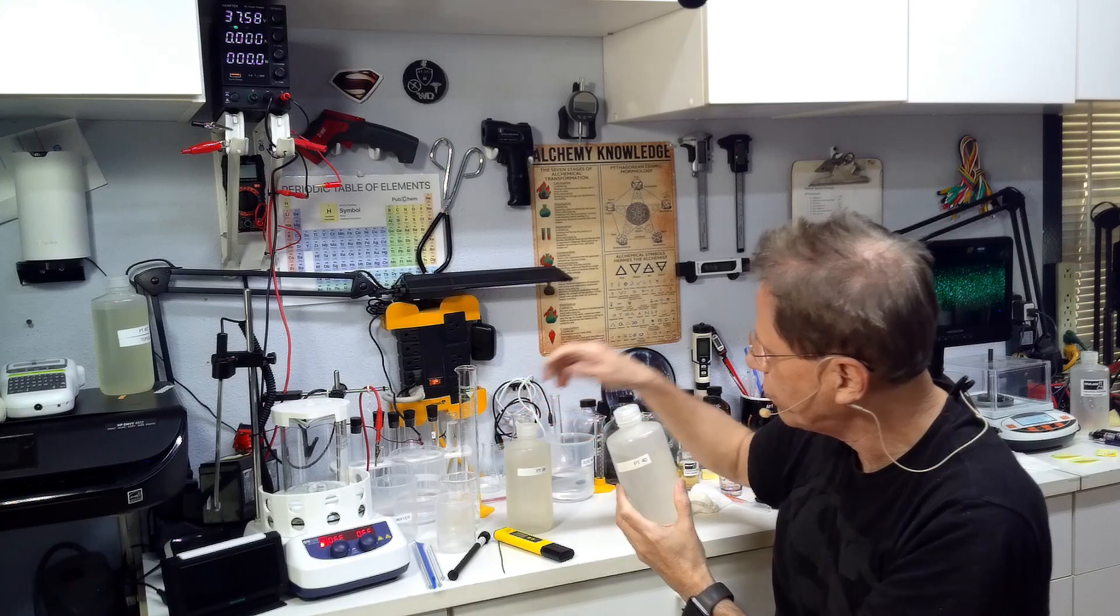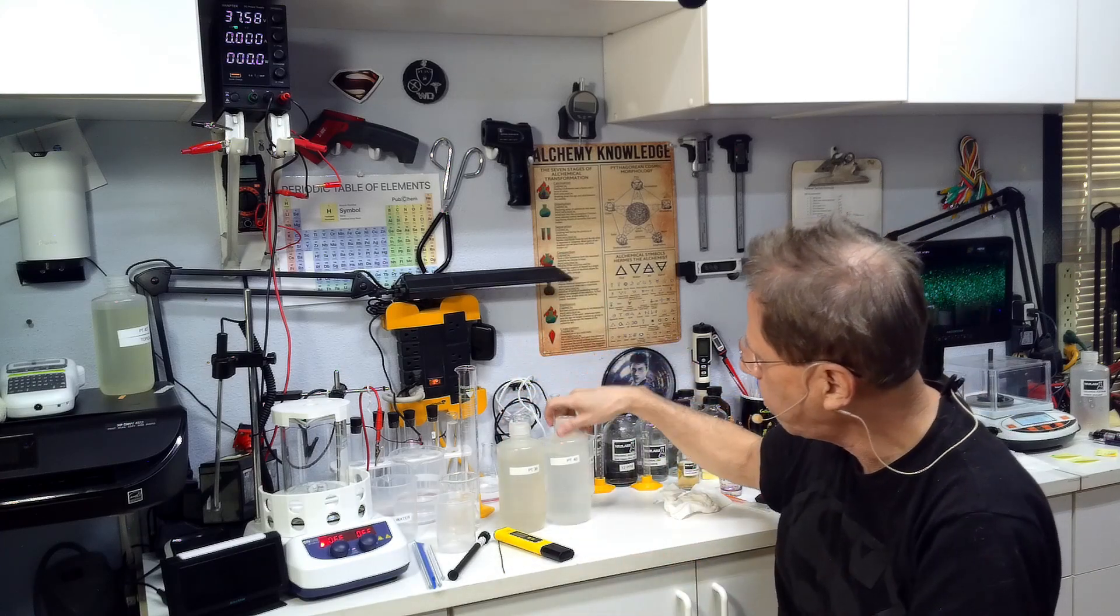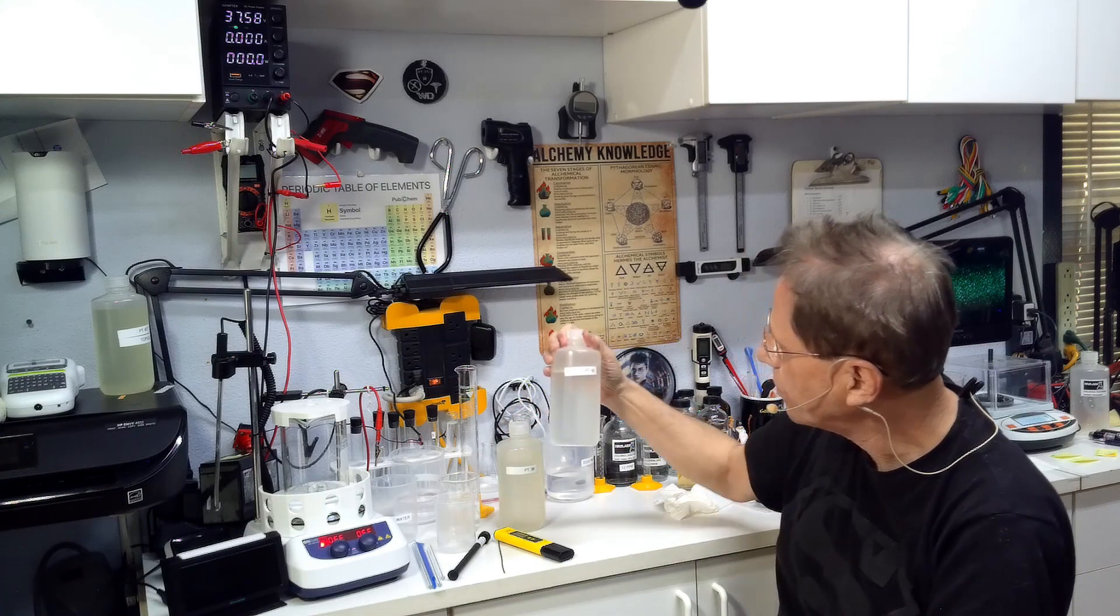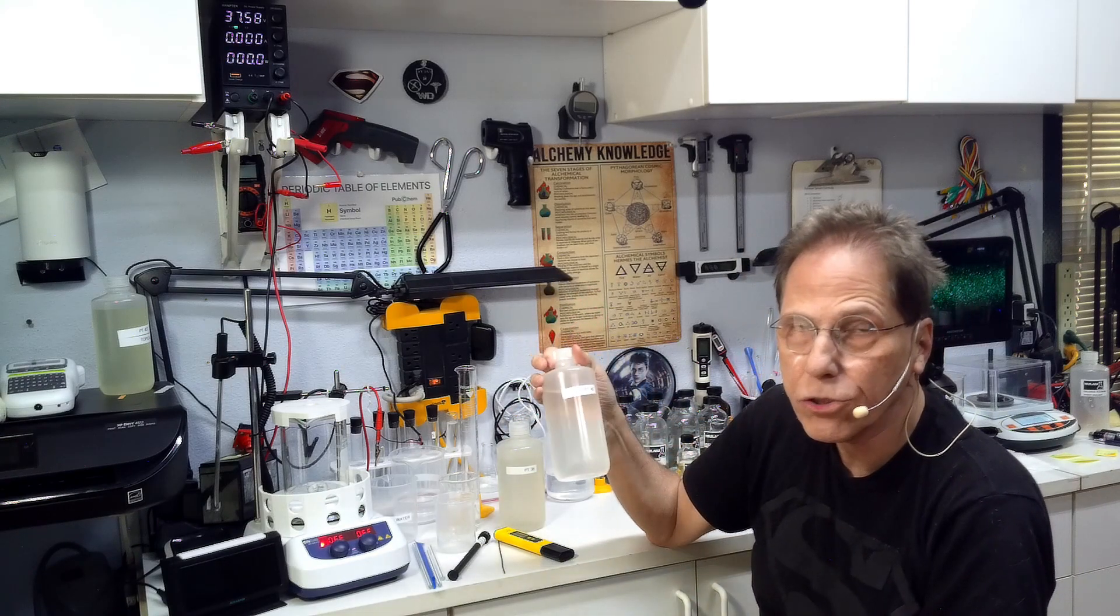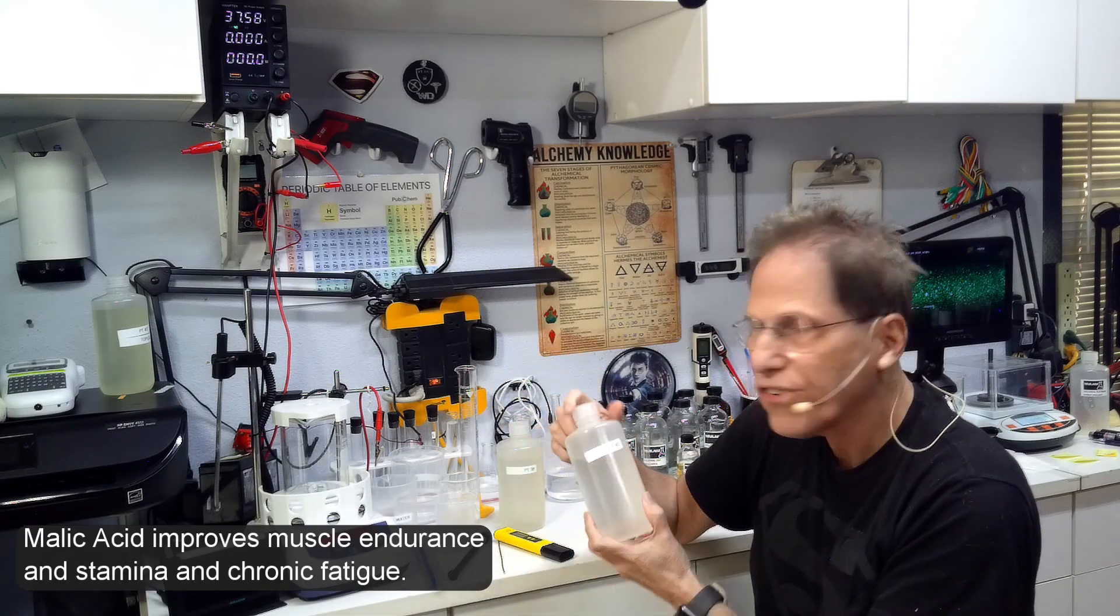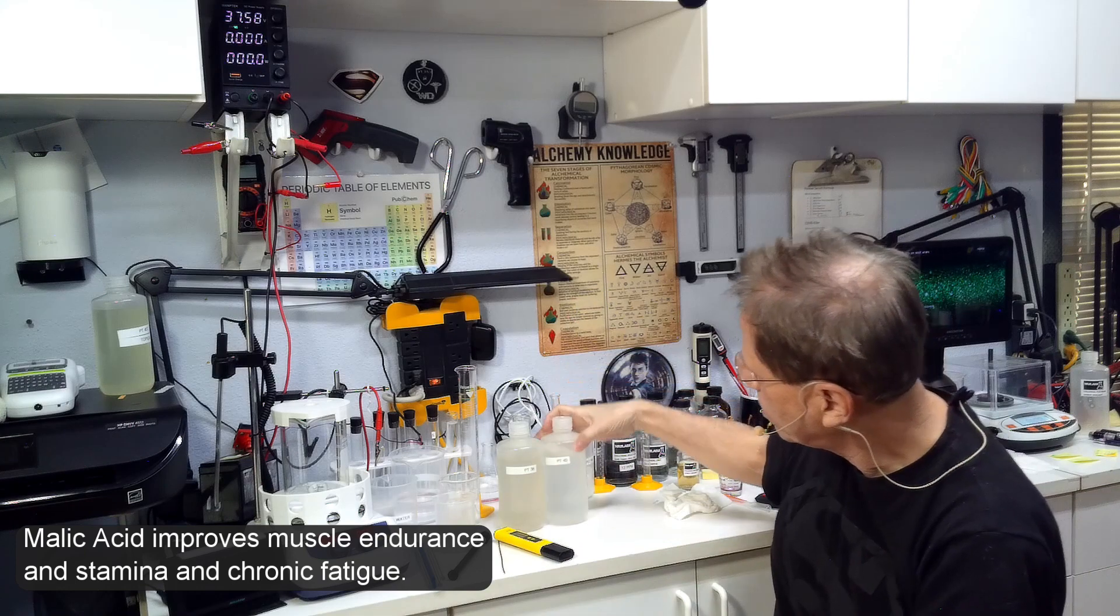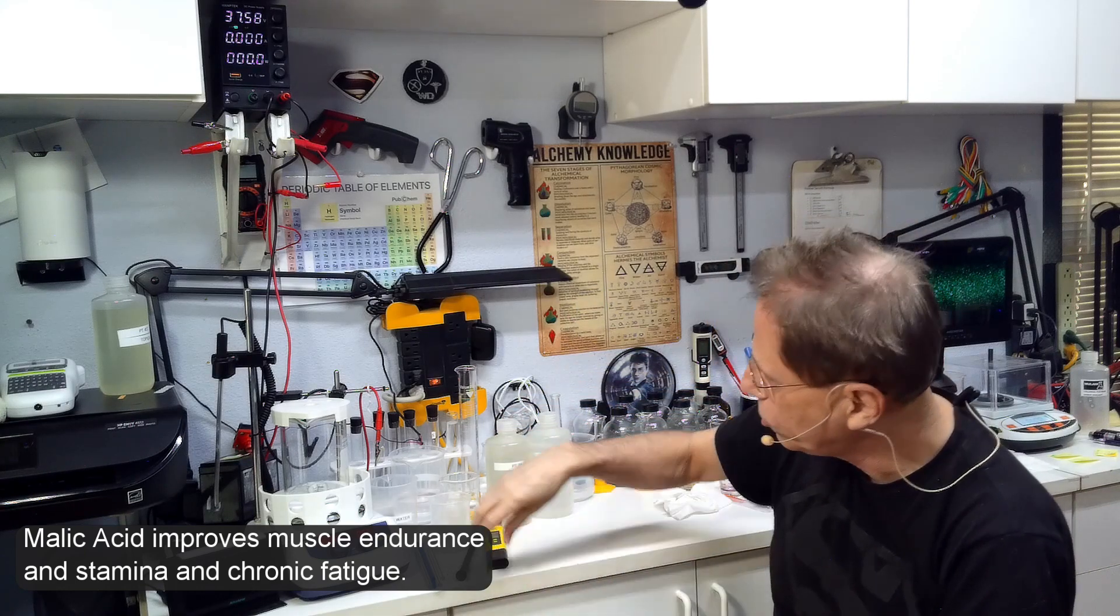On this solution I used malic acid to lower the pH down to 7.2. On this solution I used ascorbic acid to lower the pH to 7.2, and as you can see, this solution is yellowish and this solution is clear. So know that if you use ascorbic acid or citric acid you're going to get a light yellow tint to your colloidal platinum. I like mine clear and I think malic acid has some good health properties, so I use malic acid.